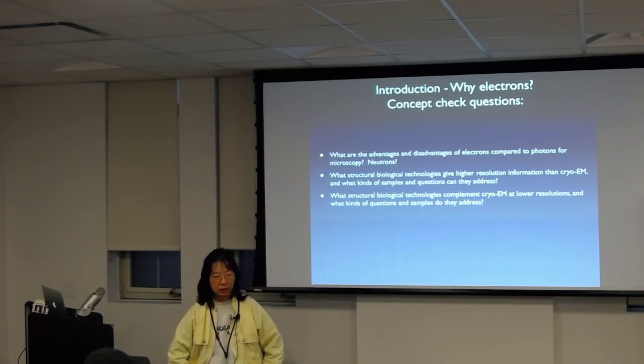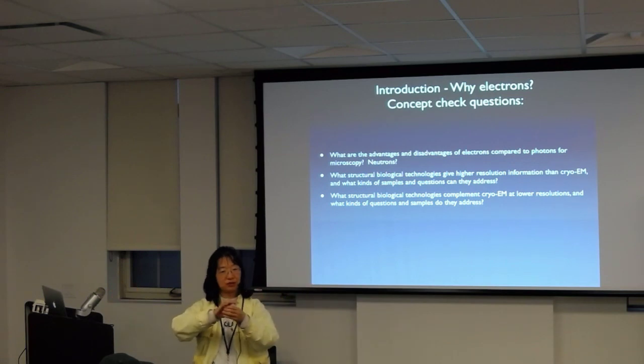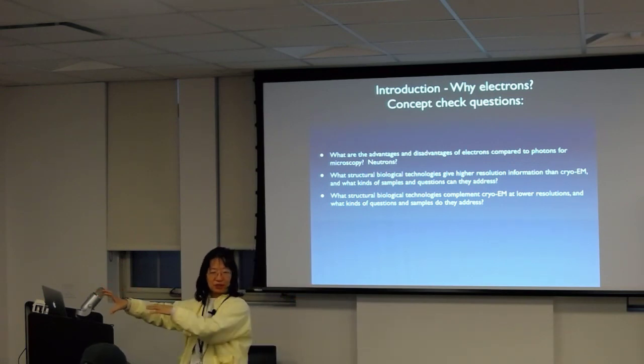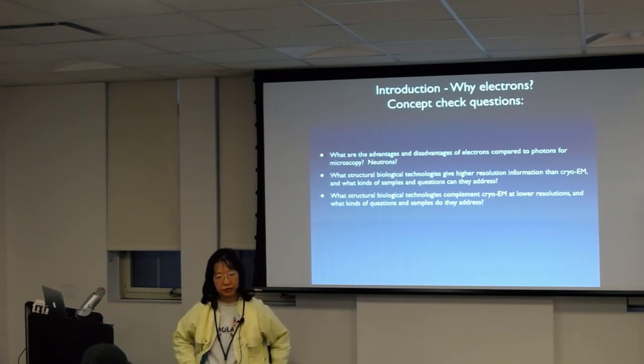There are many terms. You basically expand it out from perfect, then you can do an expansion of everything, and you have many terms on it. Just some of them are more important and some less, but each one of them will represent some kind of aberration.